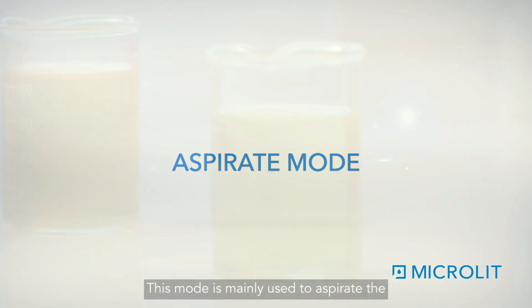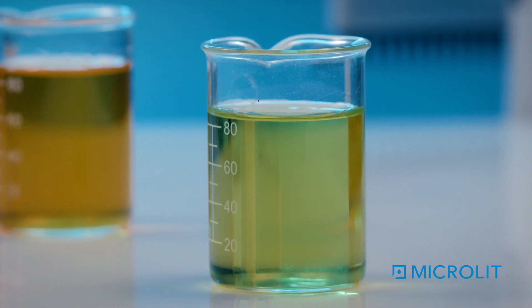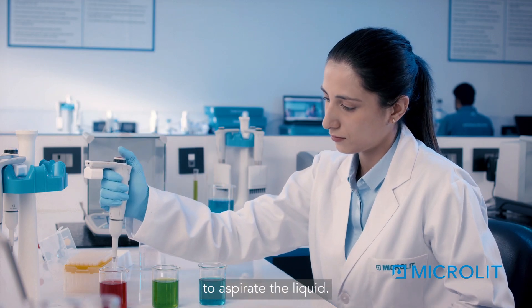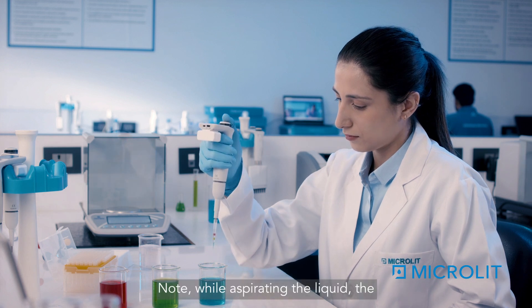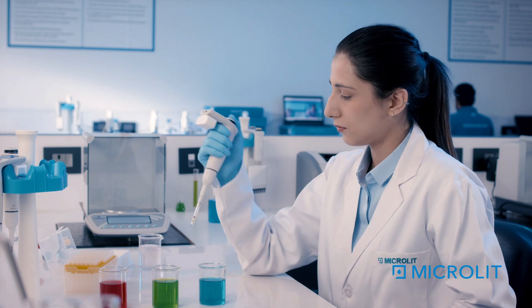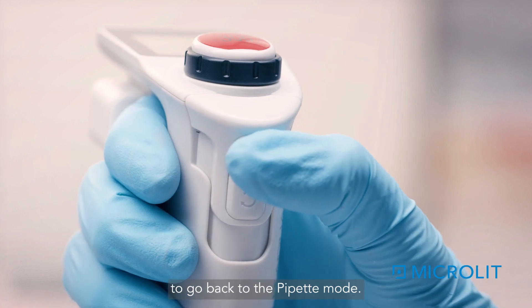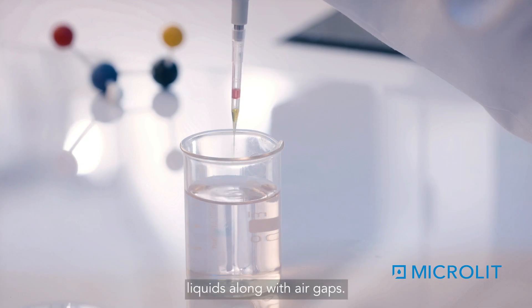Aspirate Mode is mainly used to aspirate highly volatile liquids that may drip due to high vapor tension. To select this mode, press the function button twice and select the volume using the volume adjustment wheel. Click the plunger button to aspirate the liquid, then withdraw the tip from the liquid and aspirate air columns as per the desired volume. The user can increase or decrease the volume while aspirating. To dispense all liquids along with air gaps, press the function button once to go back to Pipette Mode — the dispense indicator arrow will be shown — then press the plunger button once to dispense all the liquids along with air gaps.